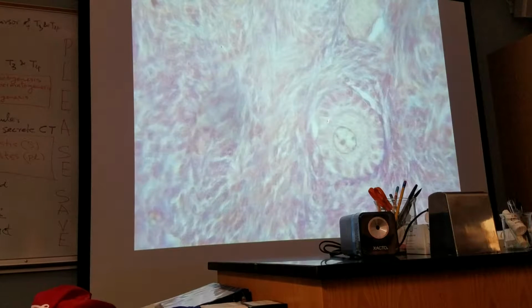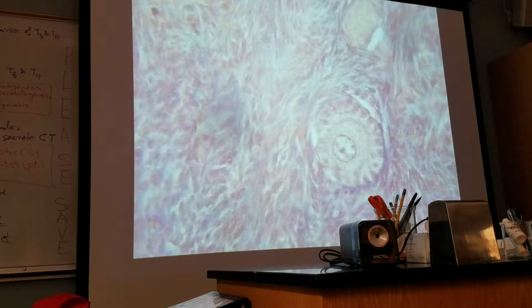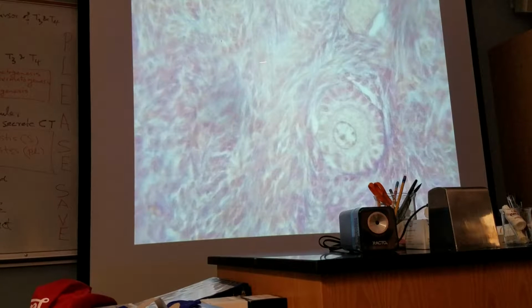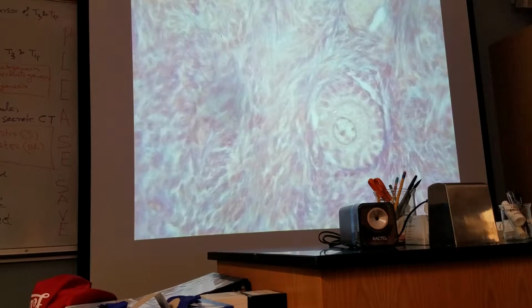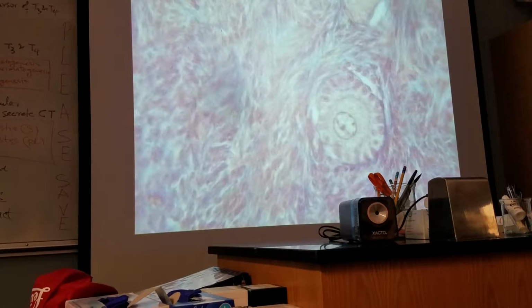These are granulosa cells. This is a small, very early primary follicle. So what is a primary follicle? You can write it like an equation: primary follicle equals granulosa cells plus primary oocyte. This is the cell, the potential gamete, the female gamete.